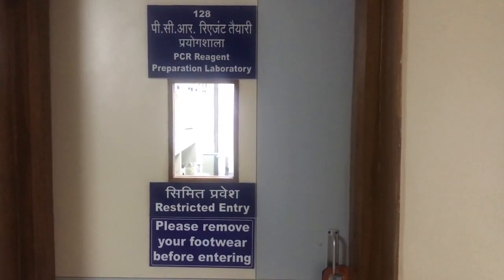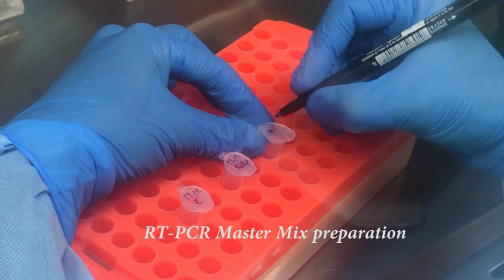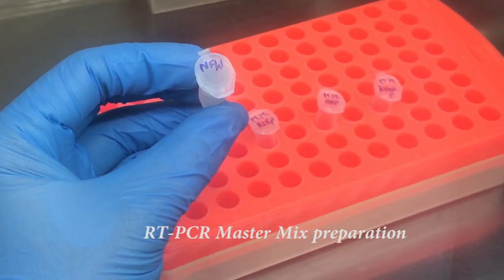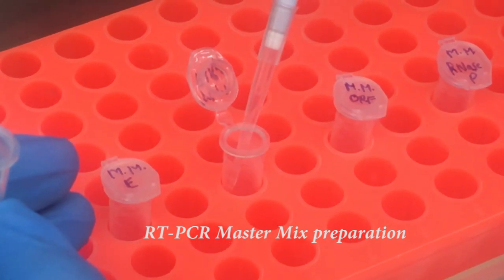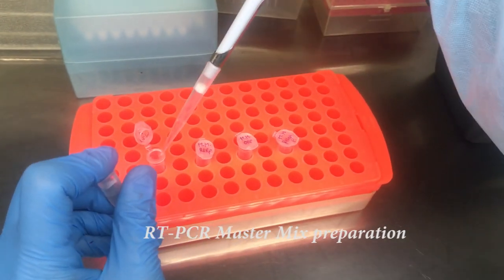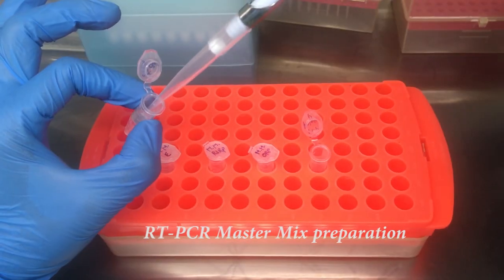The preparation of the master mix in the clean room will be simultaneous to the RNA preparation done by another personnel. Importantly, the person isolating the RNA will not enter the clean room. Work will be performed inside a biosafety cabinet, class 2A2.